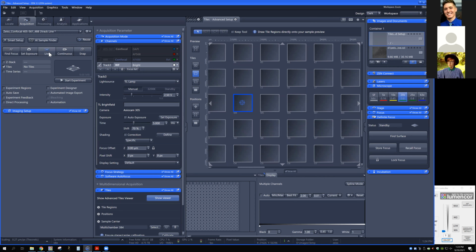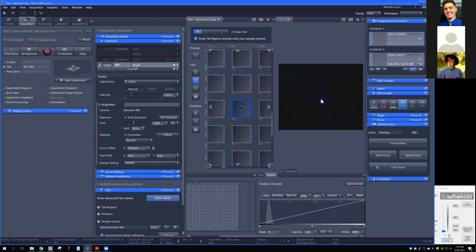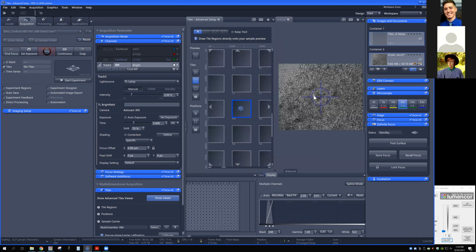Oh, really? Okay. What are the cells? What are we looking for? Looking for tiny condensates. Okay. Maybe with low power state.